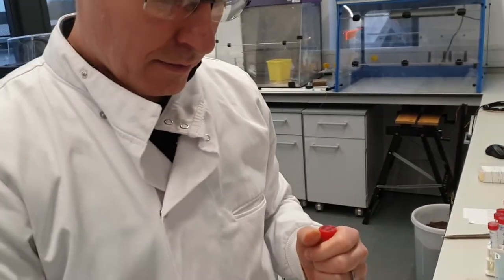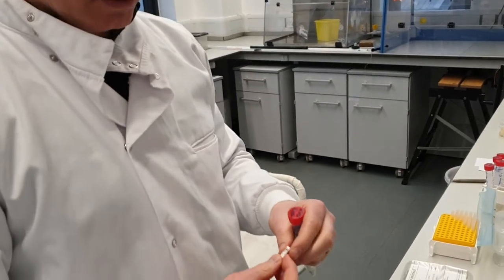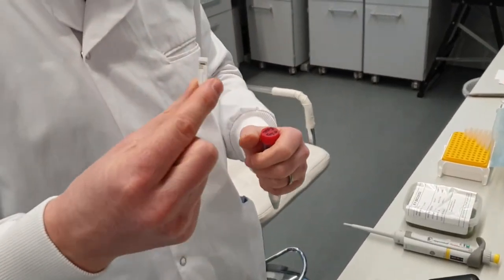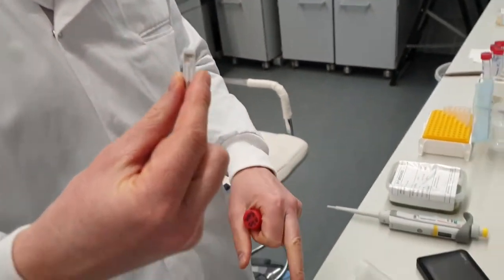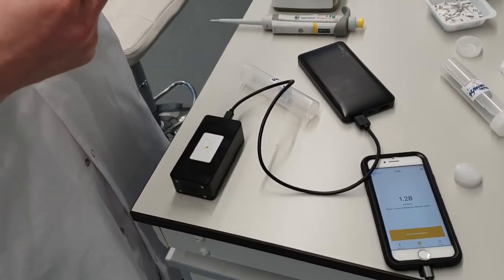So what we have is the FoodSense. The FoodSense has three main parts: it has the sensor, it has the meter, and it has the app.